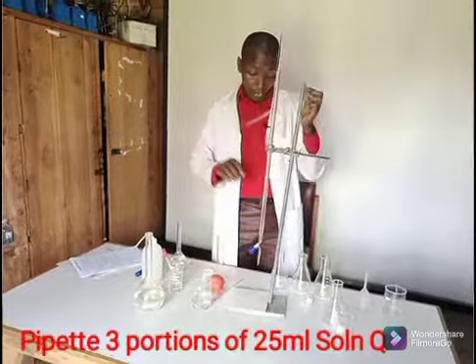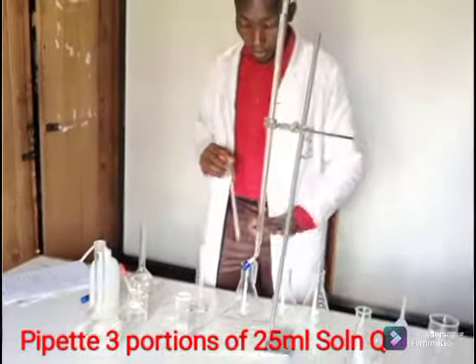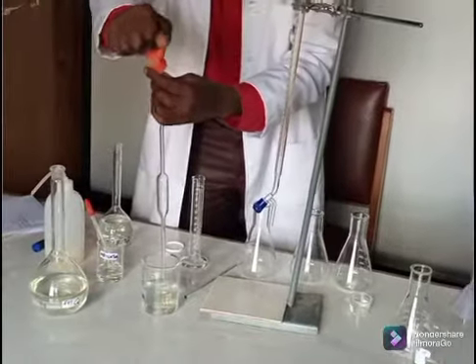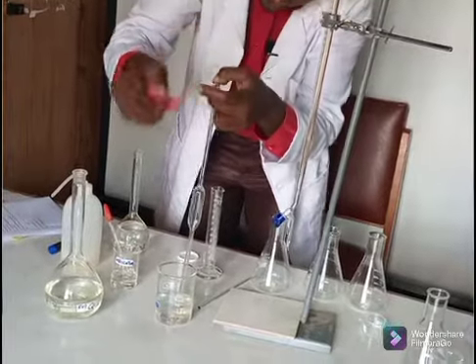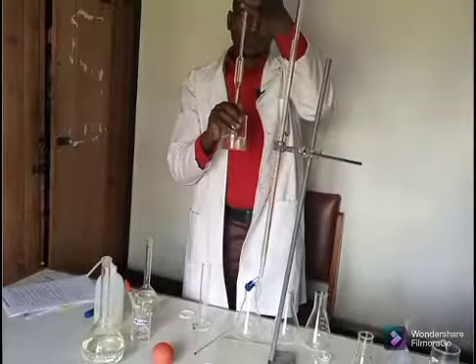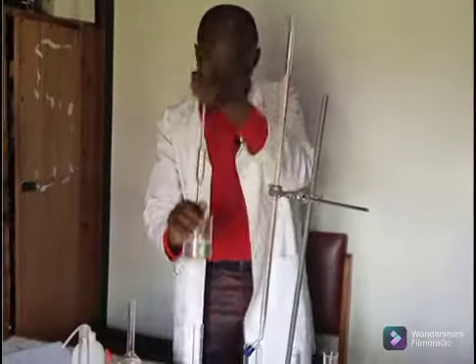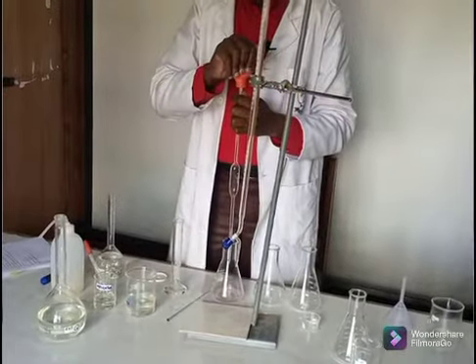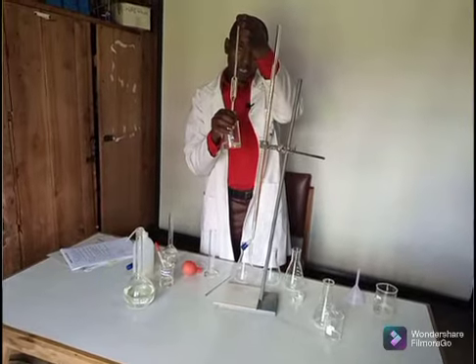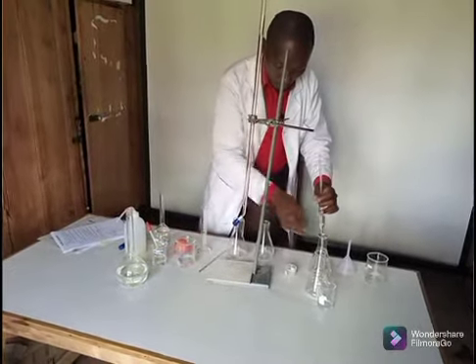Then I use a 25 ml pipette. Because I'll do three trials, I'll pipette three portions. Remember, I can go above the mark and close it very fast, then I adjust to the mark. So with that, I have the first portion, then I do another one. Now I've done two, and this is the third portion. With that, I'm ready to do my three titration processes.